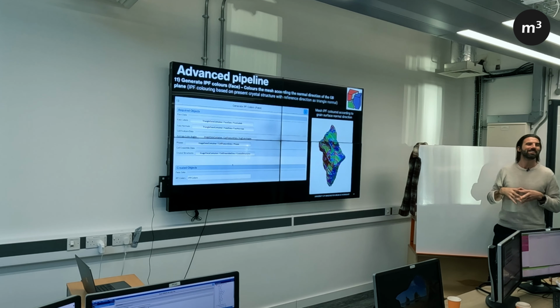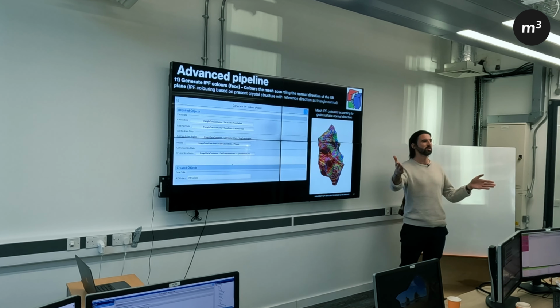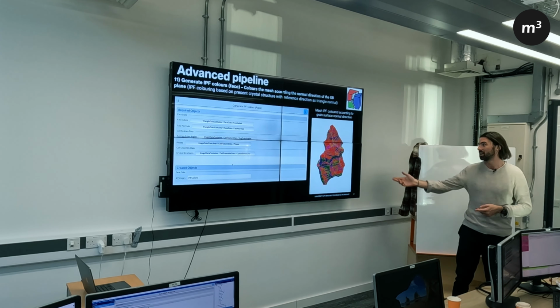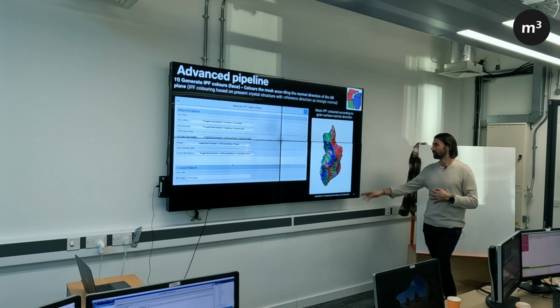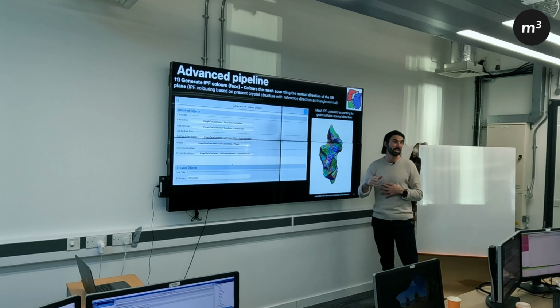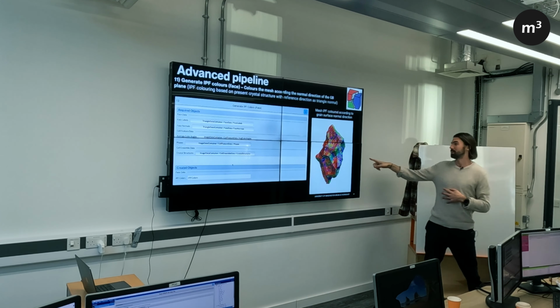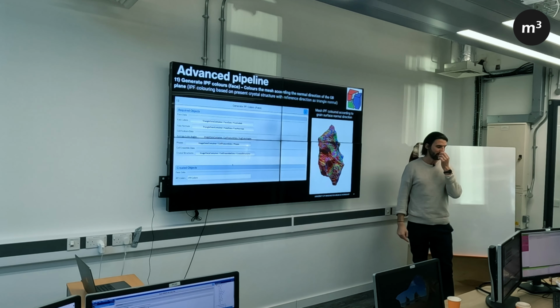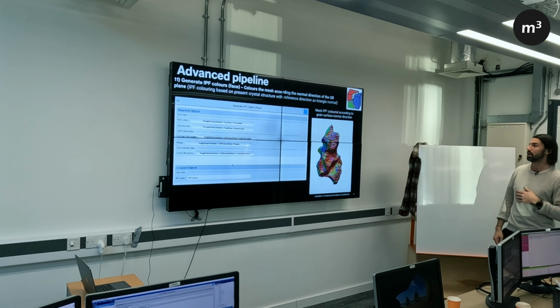And you can't just go from a lot of papers, try to correlate things to a single misorientation value from a 2D EBSD. You can see that doesn't mean anything really. And in terms of stress corrosion cracking and grain boundary energy, you can see that even on a particular single grain boundary, your local atomic ordering is going to change massively. So you need to really consider this when you're looking at crack propagation or corrosion, anything like that involves the grain boundaries.